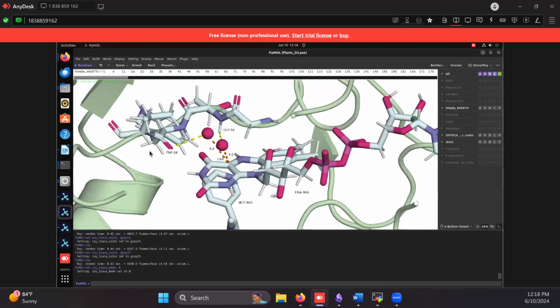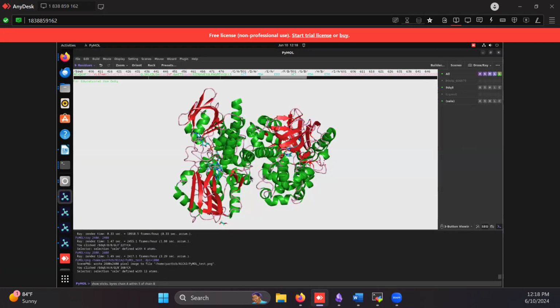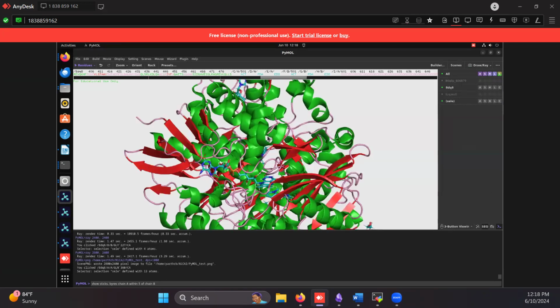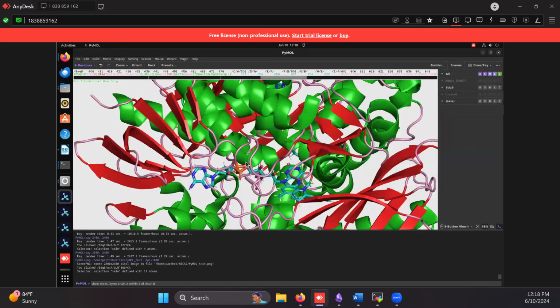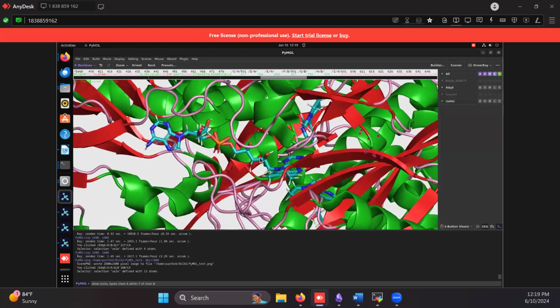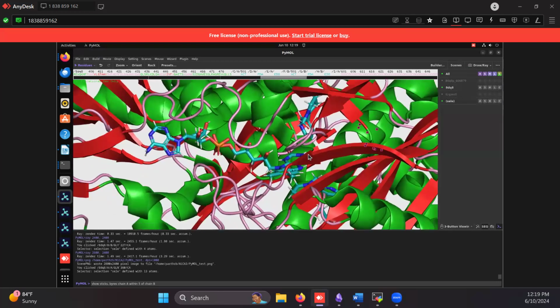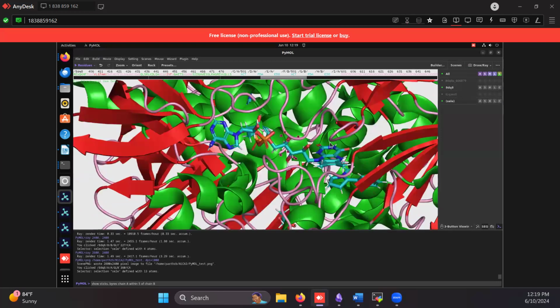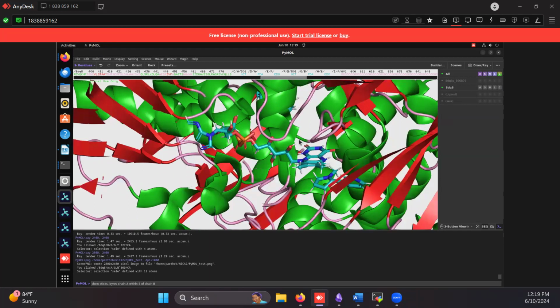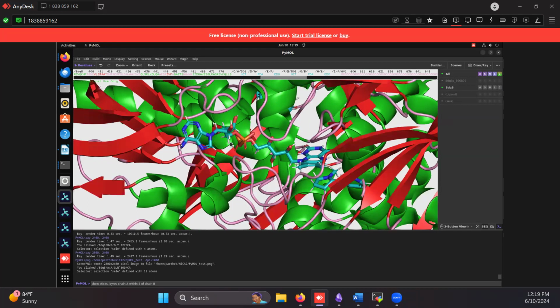So once we have our image, we want to look at this ligand and be like, hey, how do I make sure I can just see the ligand and nothing around it, right? What I would do is zoom in to the part you're looking at, try to find an angle just to see the entire ligand. Using the scroll wheel, if you scroll down, you can hide parts of the protein to a point where you can only see parts of the ligand.